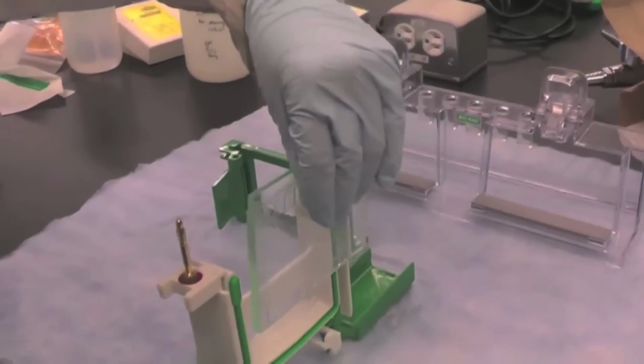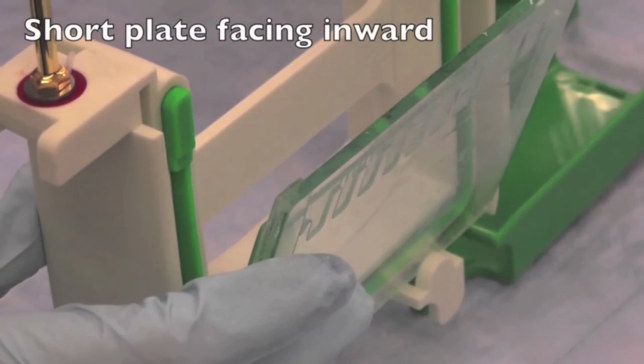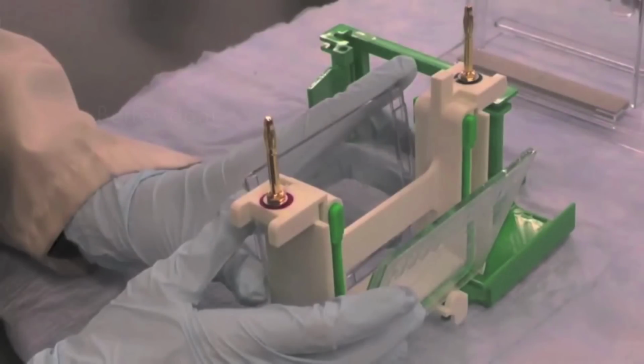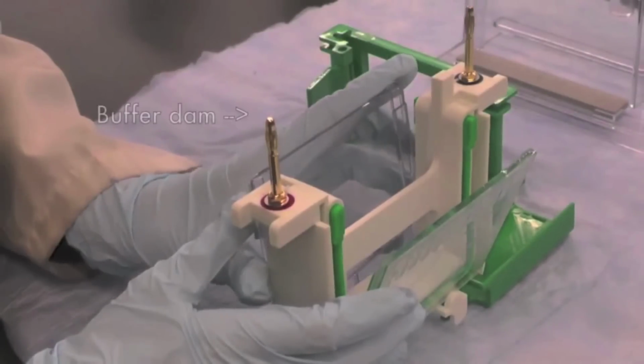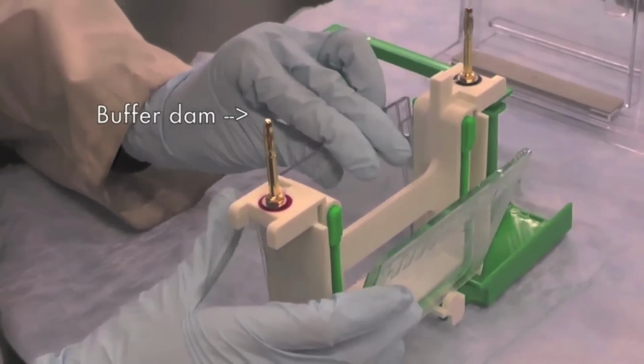Remove the gel from the saran wrap and paper towel. Tightly secure the gel with the short plate facing inwards onto the running module. Each running module can hold 2 gels. If only one gel is being run, you will need to use the buffer dam in place of the second gel.